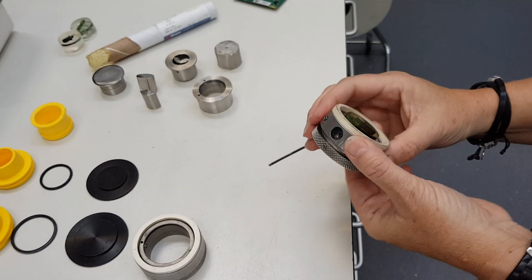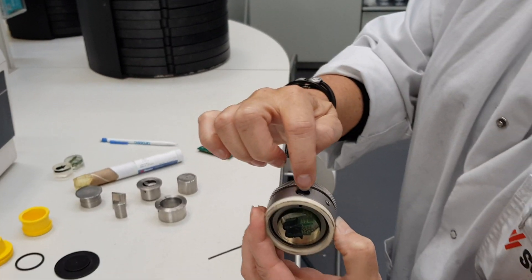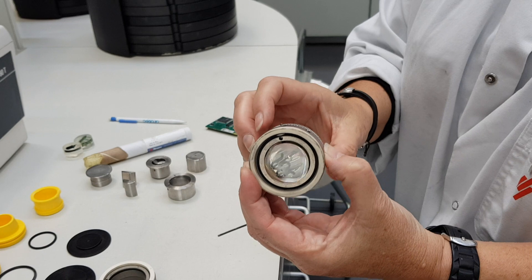So now the sample is completely at the level of the ceramic ring. Of course this should not be opened again, because as soon as you open this screw, you will not have the same position again.